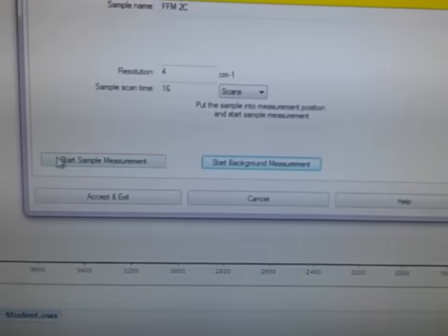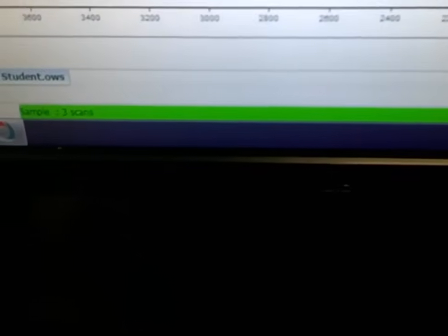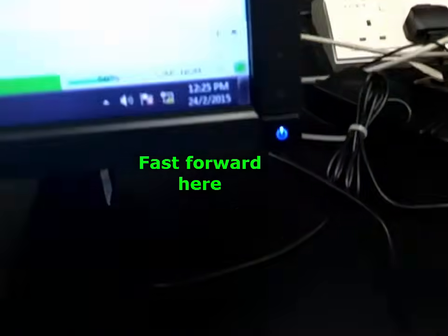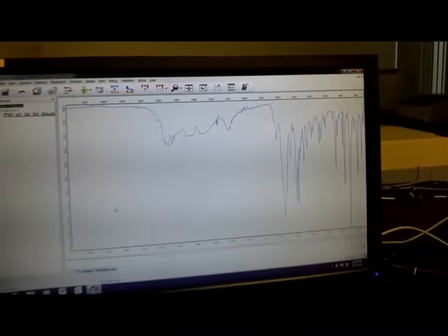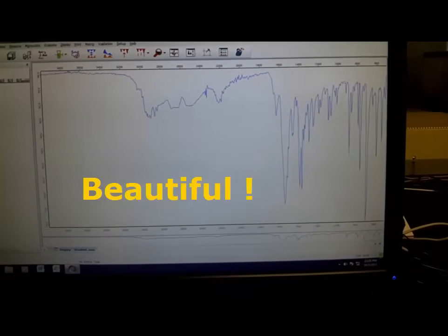And on the left, start sample measurement. See the green bar shows up once more — it tells you that it is scanning. We're almost there. And done. Very nice spectrum. Beautiful.